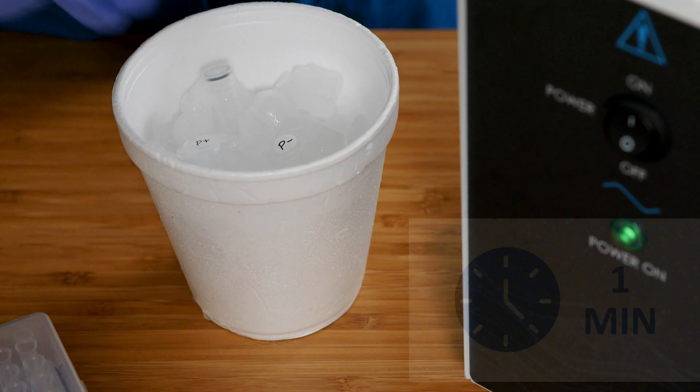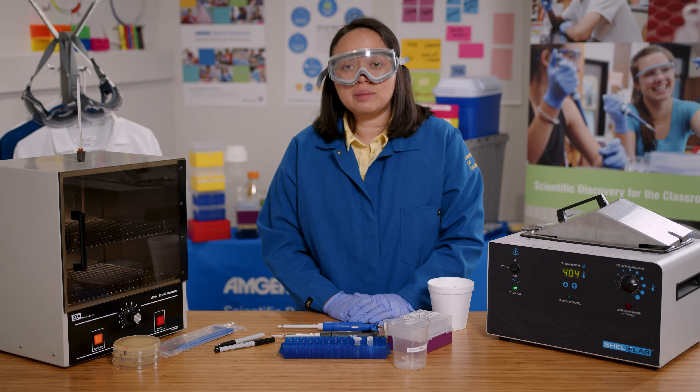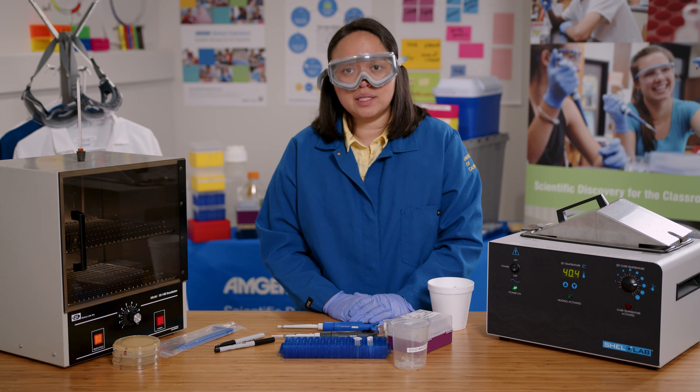Now I'll place the tubes back on ice for one minute. Then I will add 150 microliters of LB to feed the bacteria.